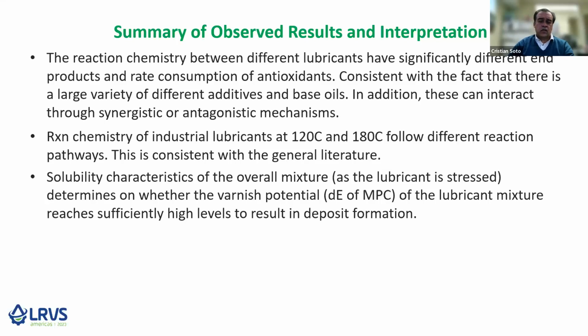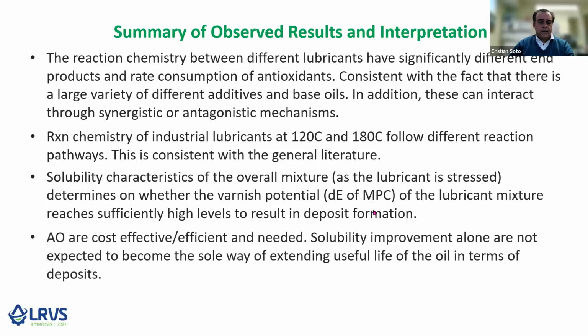This solubility can really prevent the deposition by being able to increase the solvency power of the overall mixture. This does not suggest in the presentation that antioxidants should not be used. They are effective and cost-effective, and we don't expect that solubility enhancement alone can become a way for extending the useful life of oil in terms of deposits. As we saw, there is clearly a trend on average of the benefits of having antioxidants in action.